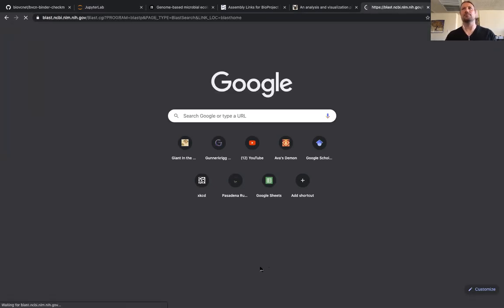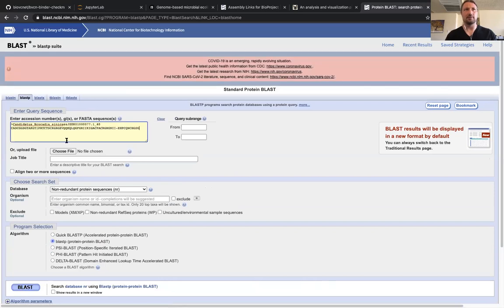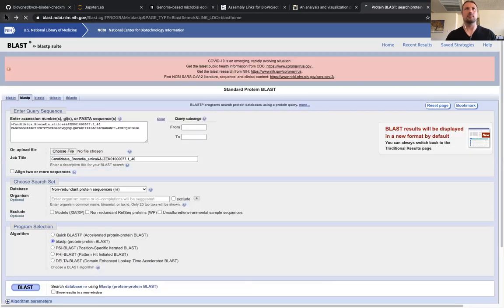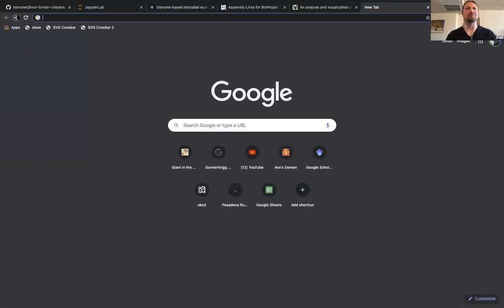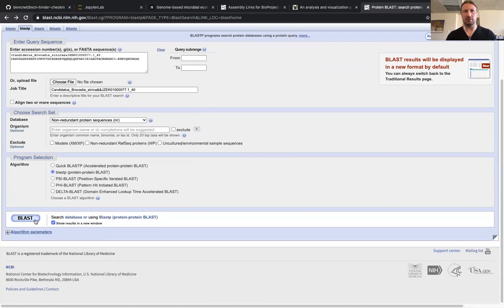For argument's sake, we will quickly BLAST these. So we're showing results in a new window.